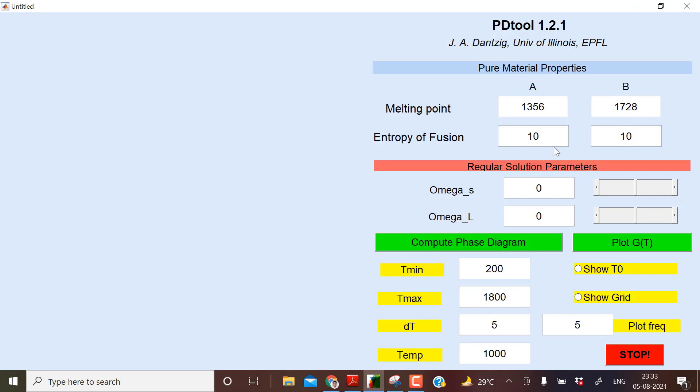1455 plus 273 is 1728. Entropy of fusion, let this value be as it is. So omega_s and omega_l - since this forms isomorphous, we know, so omega_s and omega_l let it be 0. T minimum 2000, then 1800. So here the temperature has gone up to 1728, so let me type it as 2000.